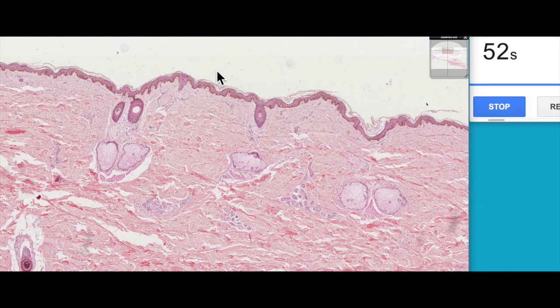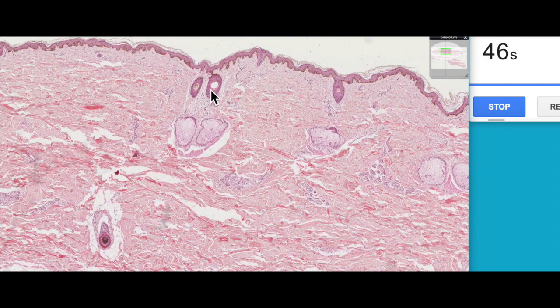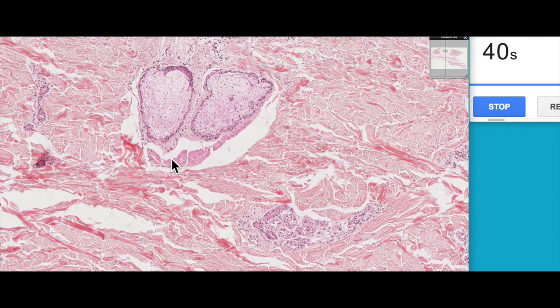They trap warm air particles near the skin and help conserve heat. In this section we can also see two hair follicles, two sebaceous glands, and a little bit of the erector pili muscle again.